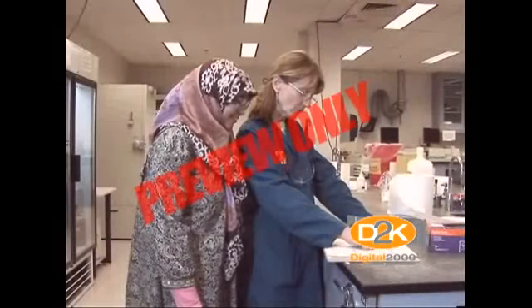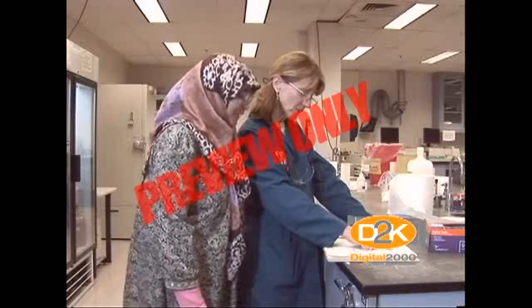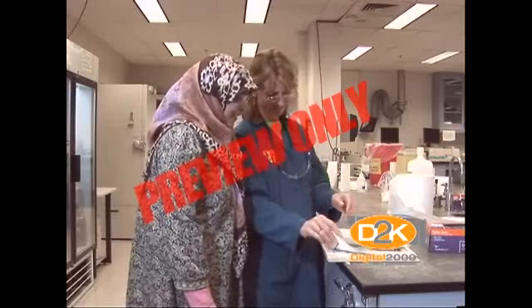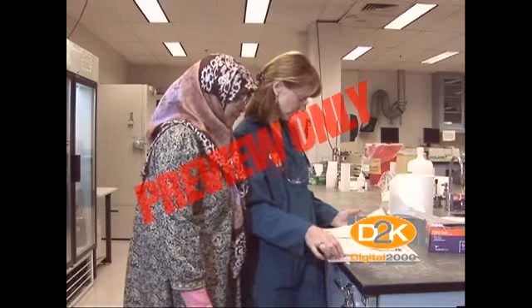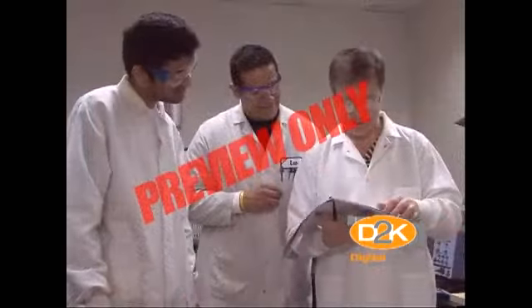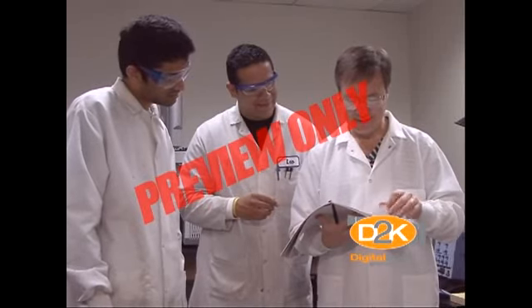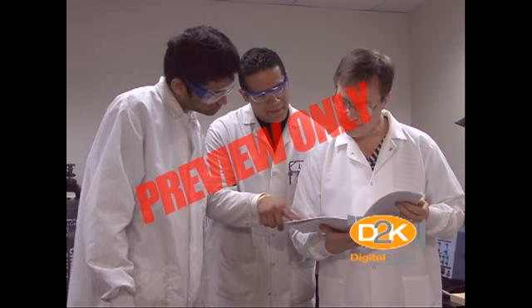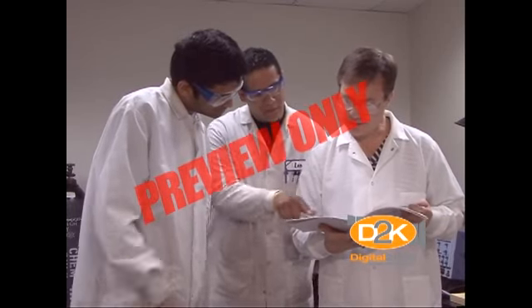Your university's laboratory safety program is comprised of the Chemical Hygiene Program, Biological Safety Program, and Radiation Safety Program, and other specific topics. In this program, we will cover the Biological Safety Program and how you can use this information to stay safe and healthy in a learning environment.